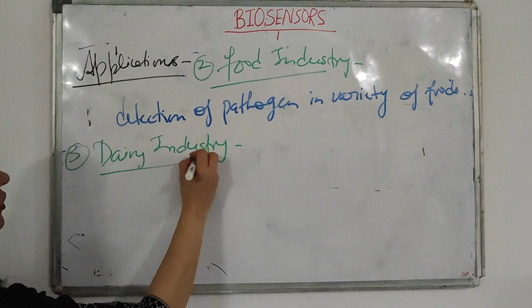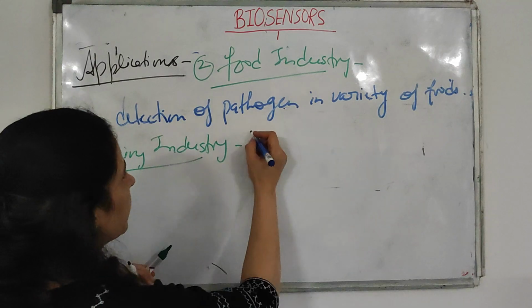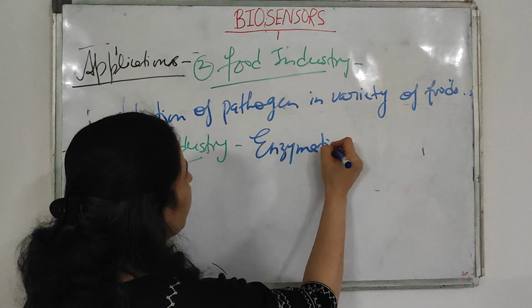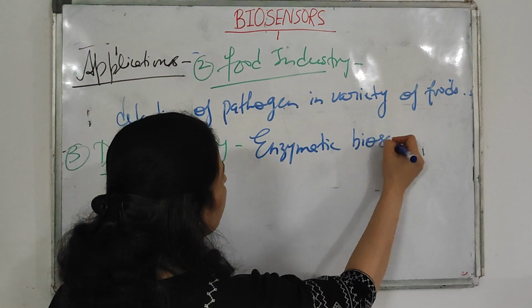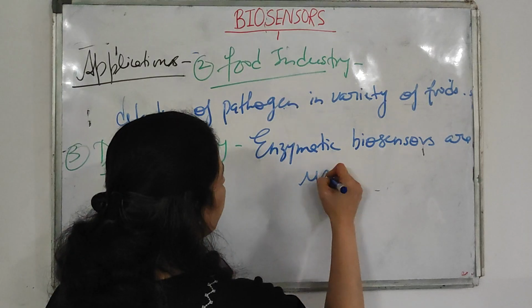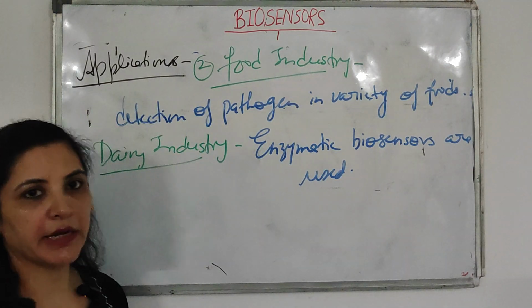In the dairy industry, enzymatic biosensors are used. Okay, so enzymatic biosensors you will use in your dairy industry.